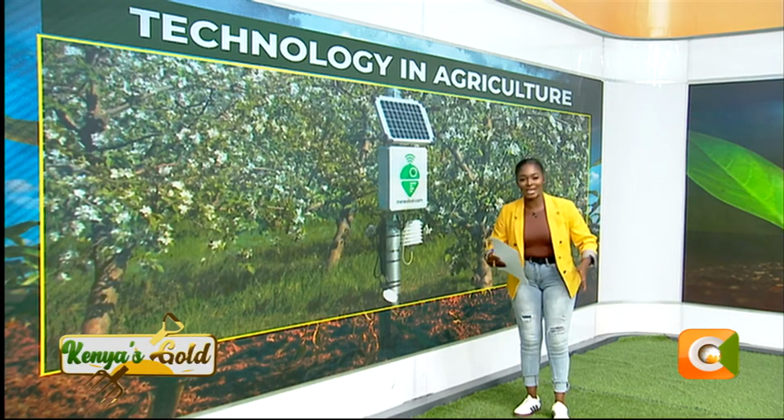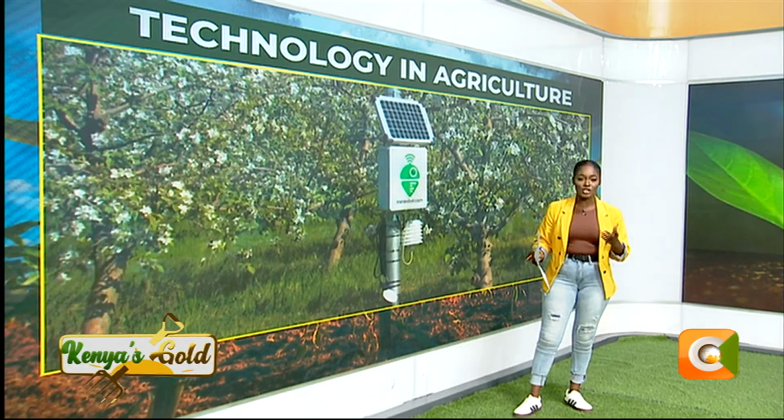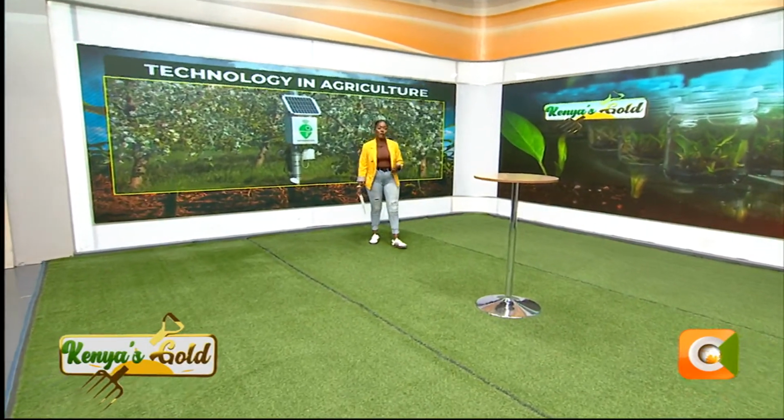That is not a precise way of practicing agriculture, and we're encouraging our farmers to exercise precision agriculture, and this technology guarantees you that. Now, the technology we will be focusing on the show today is called tissue culture, which is a modern method of seed propagation. We get to learn in detail about that from KALRO. Take a look.